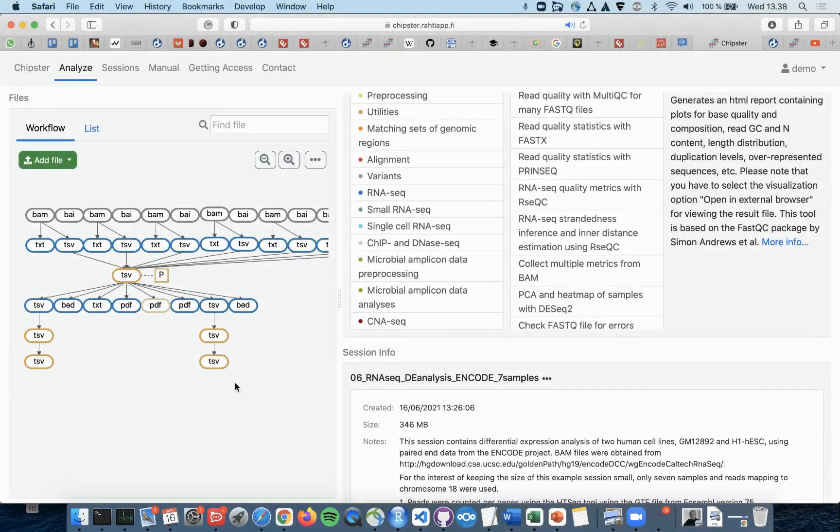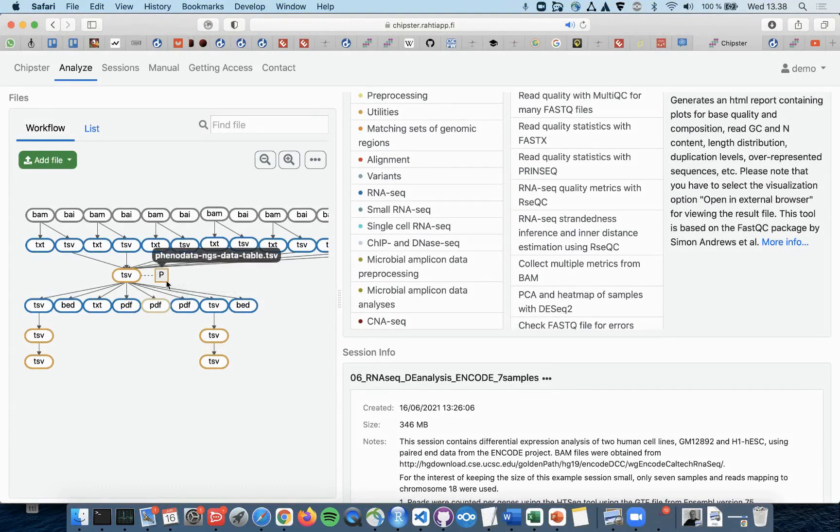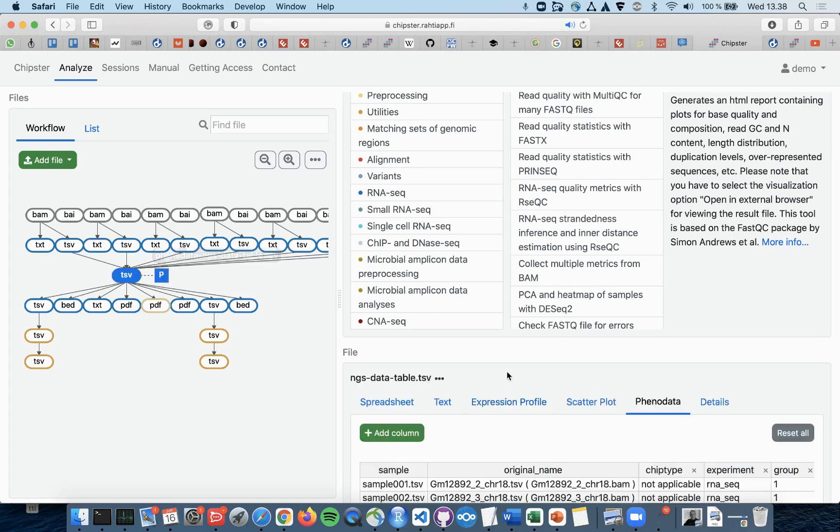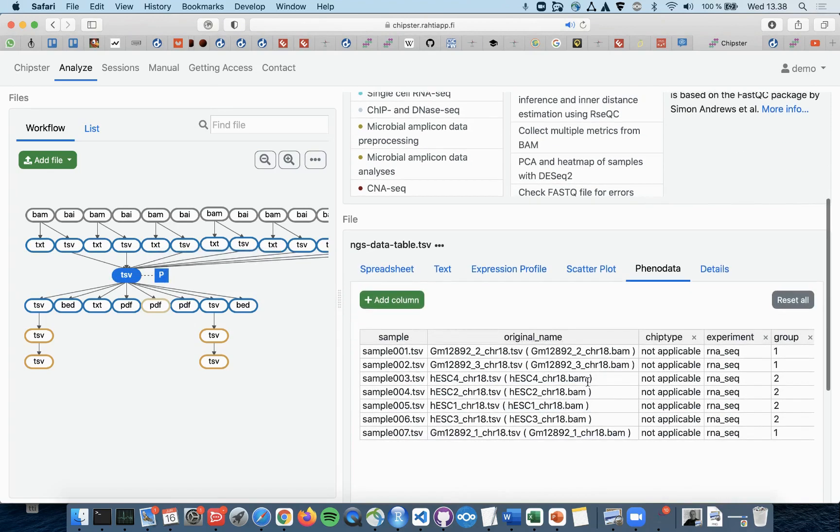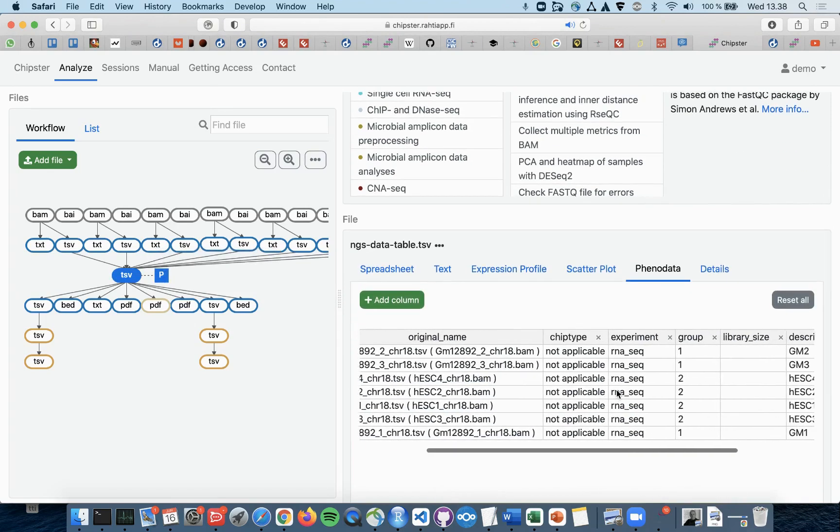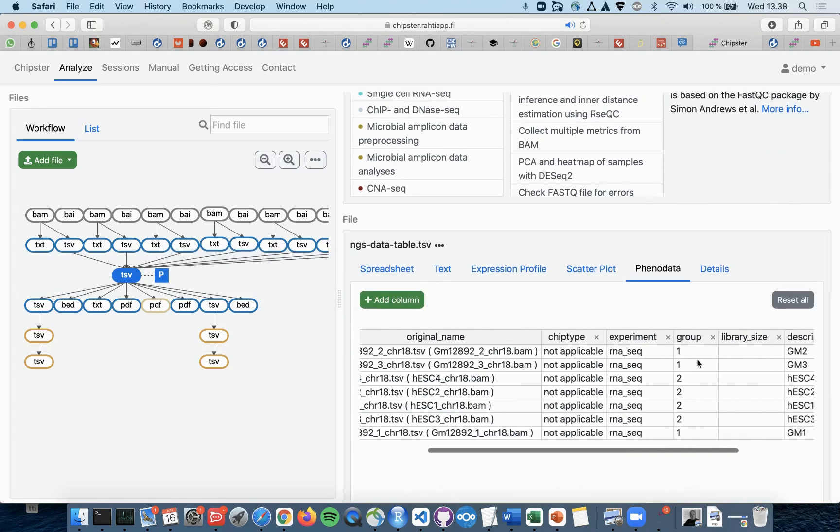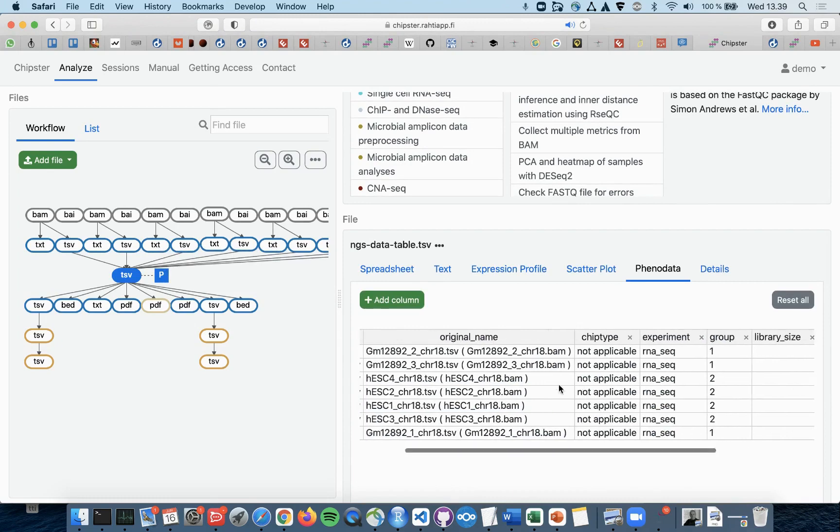When doing RNA-seq analysis in Chipster, you most likely need to at some point create a phenodata file where you can determine which samples belong to which sample group or experimental group.